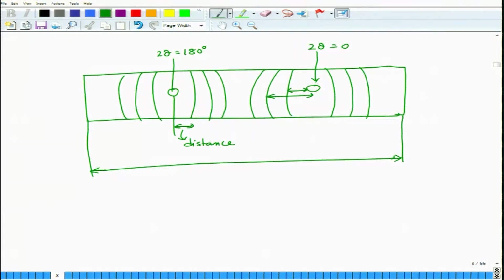So basically you complete the calculation of all the thetas. Once you determine all the thetas, after that you can determine what plane it is and which material it is.